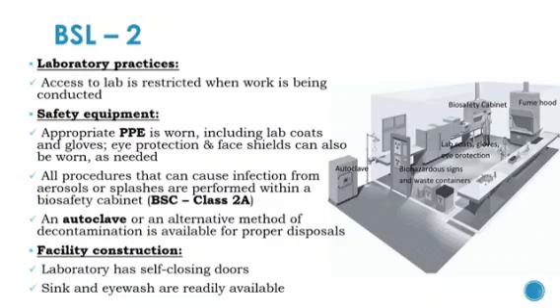Biosafety Level 2. The microbes here pose moderate hazard to the laboratorians and the environment, and are typically indigenous and associated with diseases of varying severity. An example of a microbe that is typically worked with at a biosafety level 2 laboratory is Staphylococcus aureus. This is the type of biosafety level followed in most clinical diagnostic laboratories.